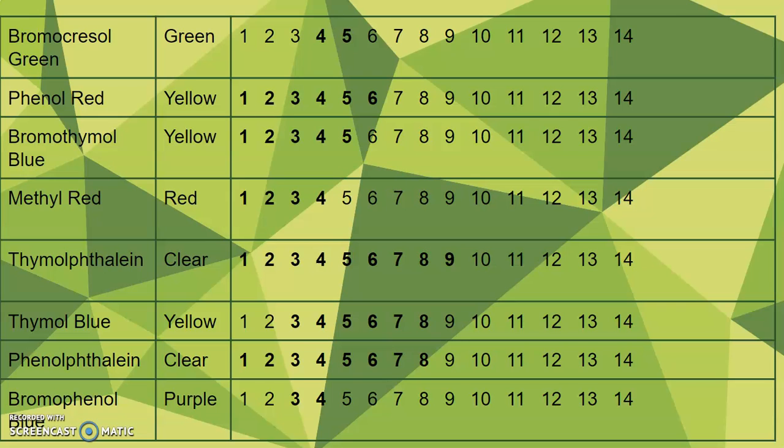So we're going to ask you to do that again with a second mystery solution. It'll have different looking colors and it'll be very different. The answer you're going to find is a whole number. So just make sure that when you do that, you don't get a pH of 4.35. It's either going to be a 4, a 2, a 12, whatever. It'll be something firmly in a whole number pH.